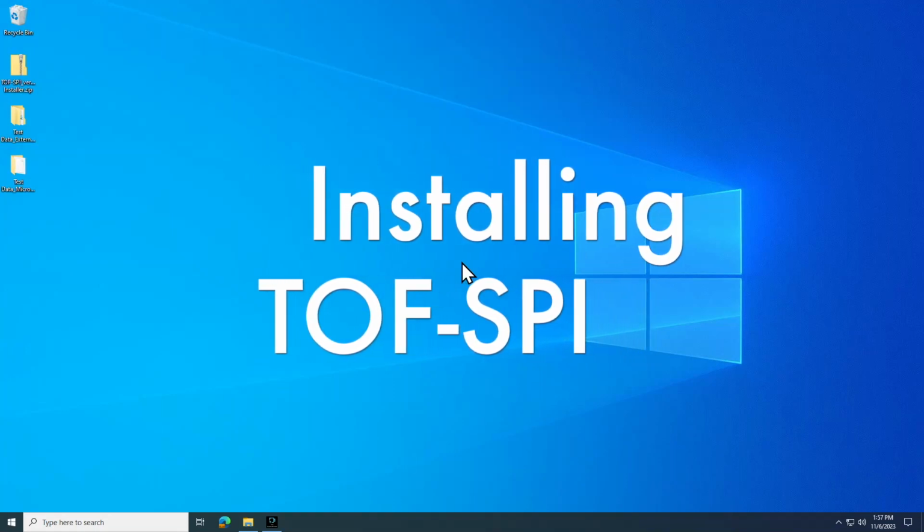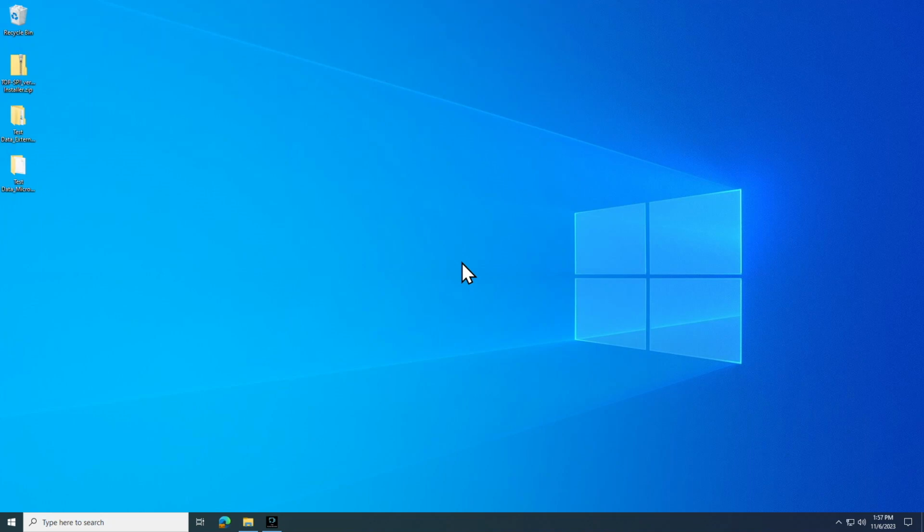Welcome. This video is going to explain the droplet calibration workflow in Time-of-Flight Single Particle Investigator, or TOF SPI. We're going to start by installing the software.